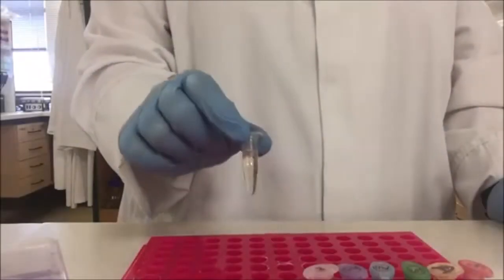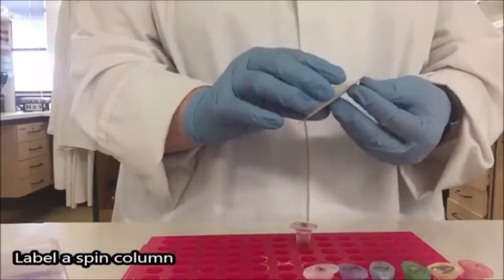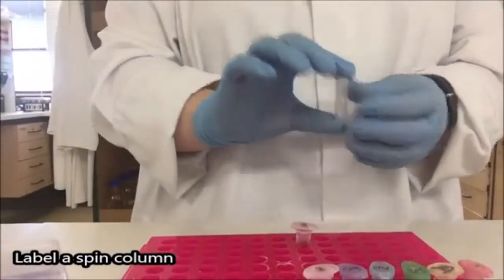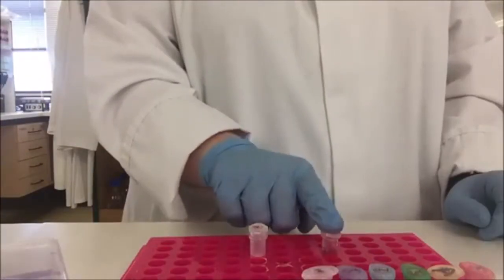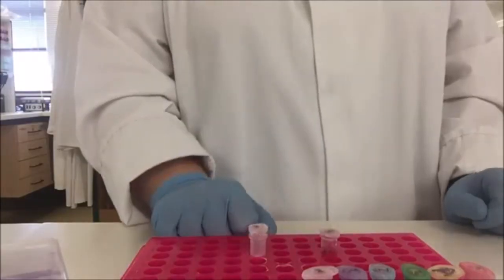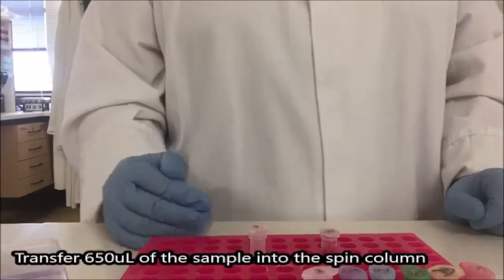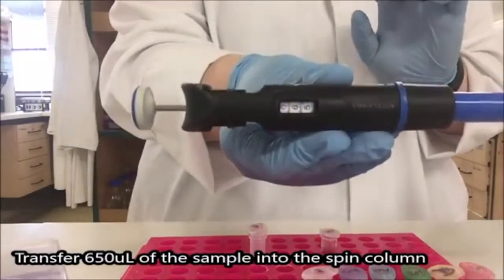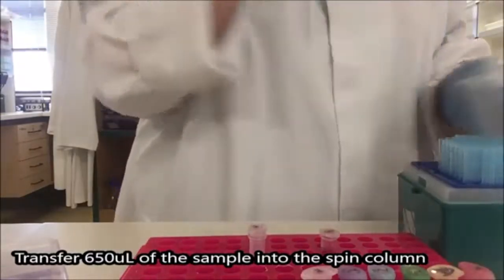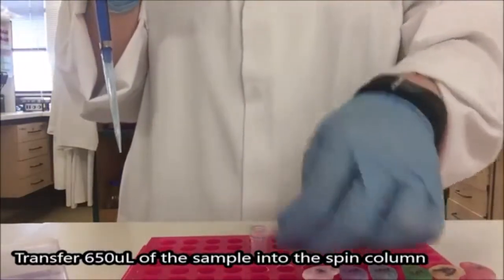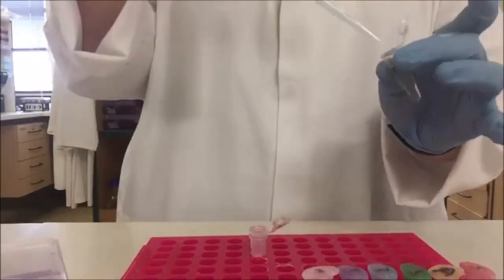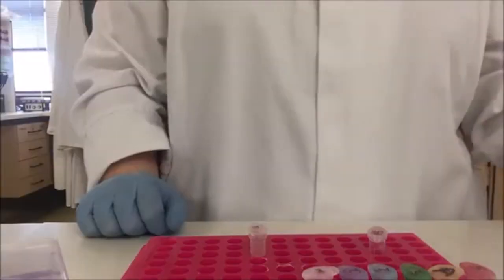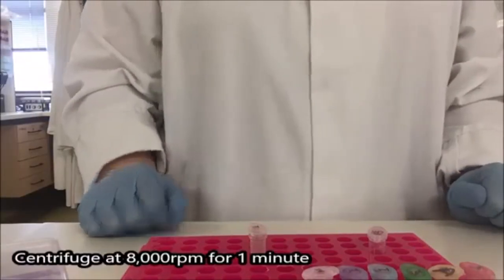I'm now going to transfer this mixture into a spin column. You'll notice that while the shredder column that we used earlier was purple, this spin column is white. The full volume of our sample will not fit into the top of our spin column. So I'm going to do this step twice in 650 mcl lots. Using the blue pipette set to 065, I'm going to transfer in what will turn out to be approximately half of our sample to the top of our spin column. And I'm going to centrifuge this for one minute at 8000.